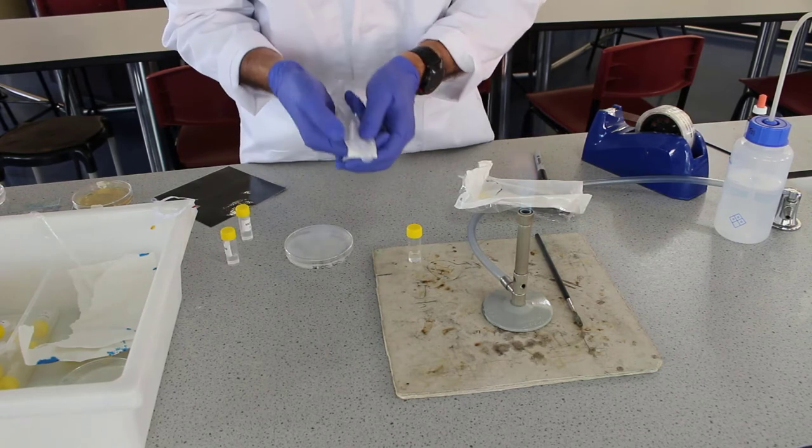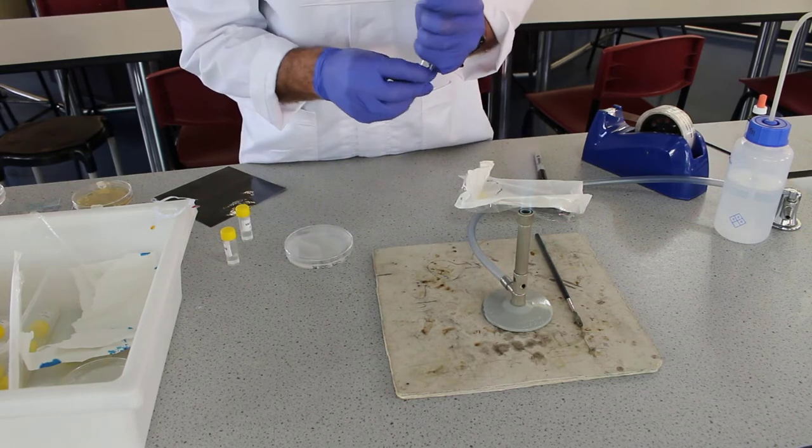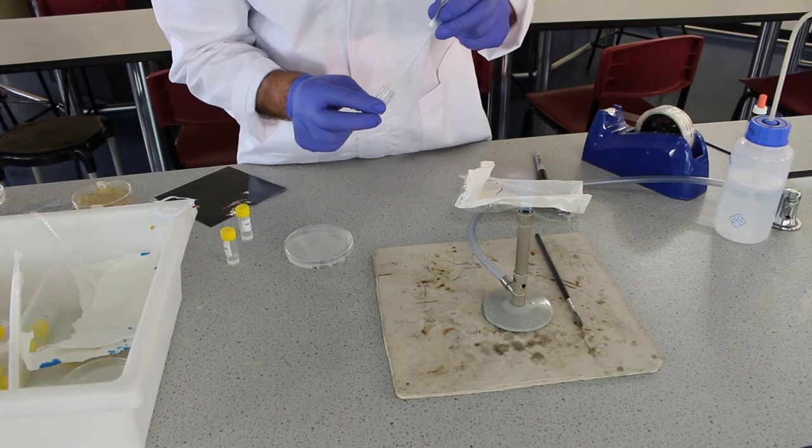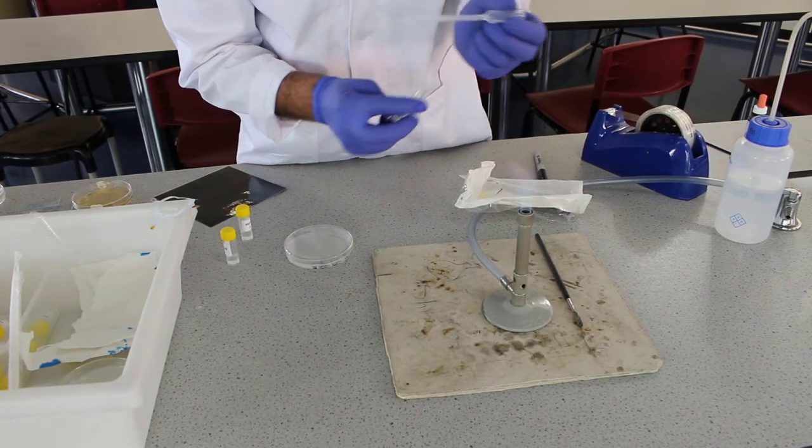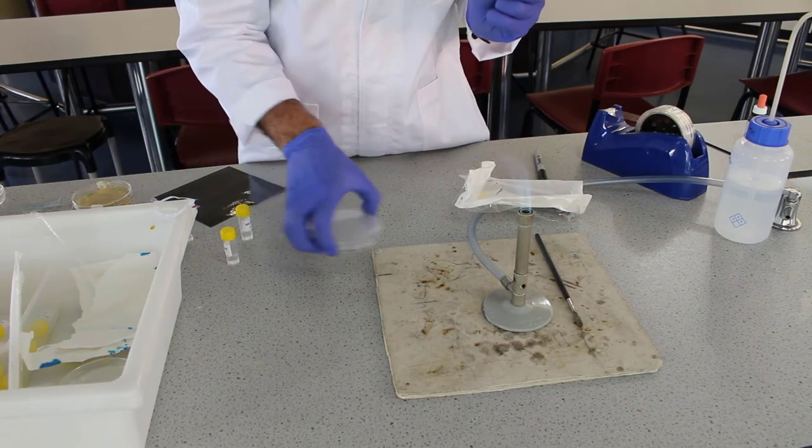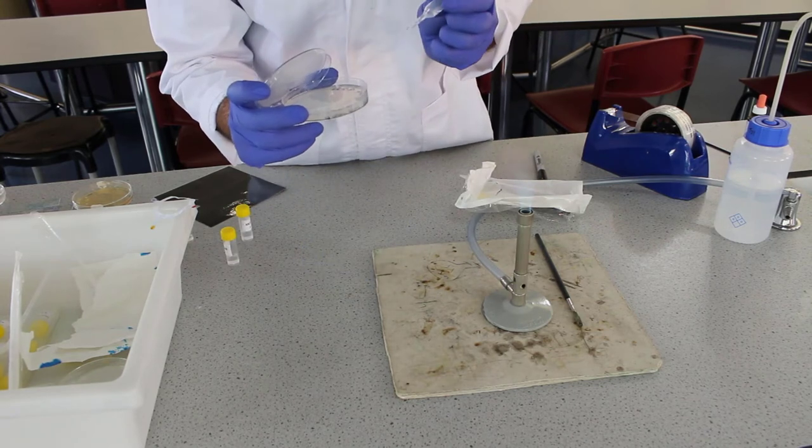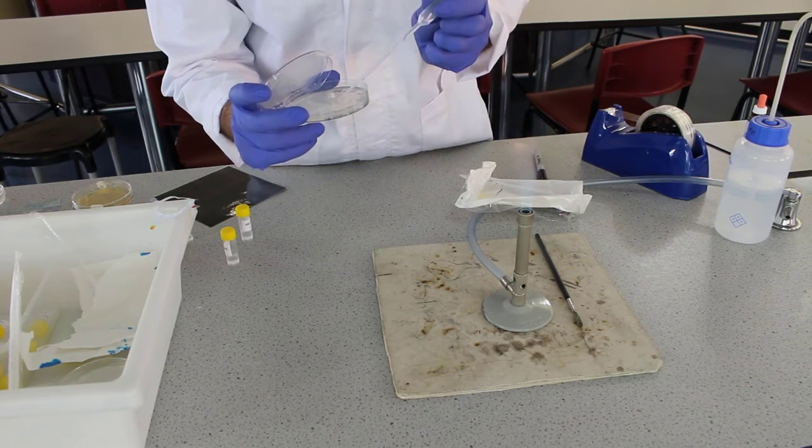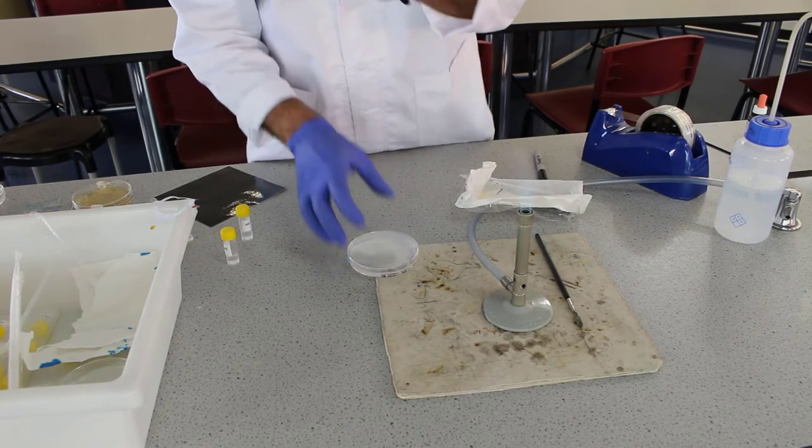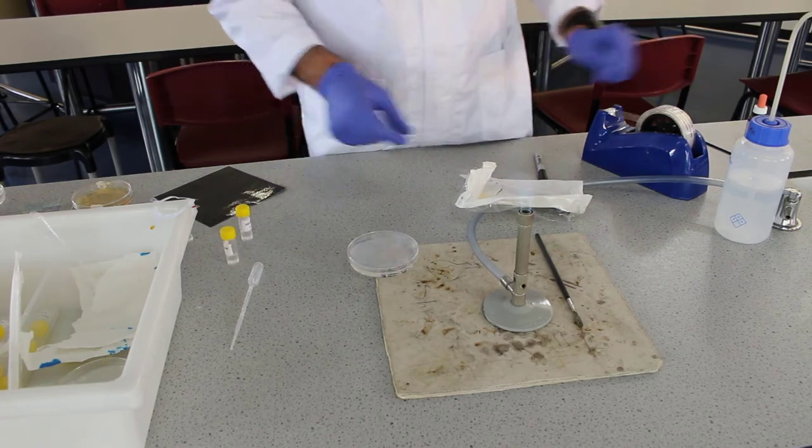Open up our sterile transfer pipette. Open up our vial. Remember to hold the lid of the vial. Take some of the inoculant up into the transfer pipette. It's just literally just a couple of drops on the plate. Not very much. It's very easy to put too much on. Everything that we've used will then be disposed of. Just set it aside for now.